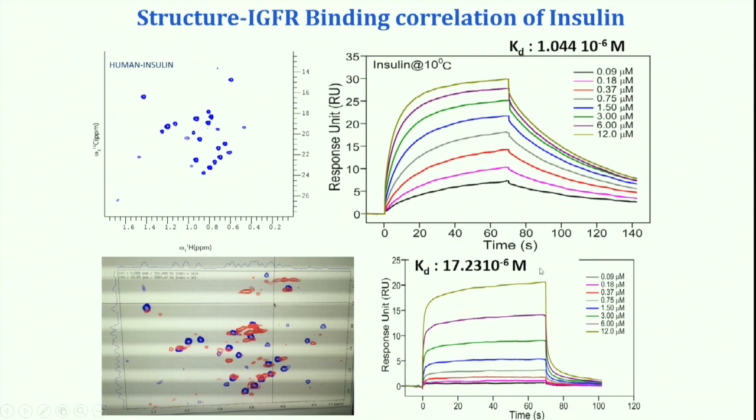Therefore, it is recommended that you work robustly on getting the correct folded form of insulin before you really go for a functional analysis. That is what we show, that getting the higher order structure is extremely crucial before we really go for a functional analysis of these biomolecules. So far so good.